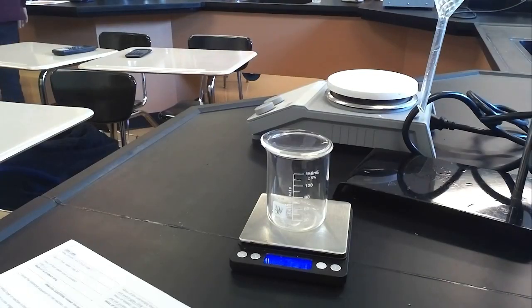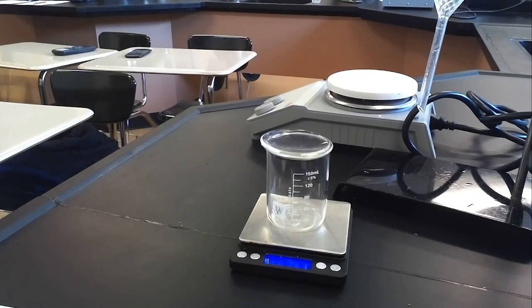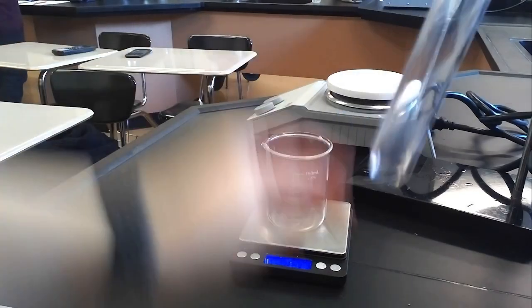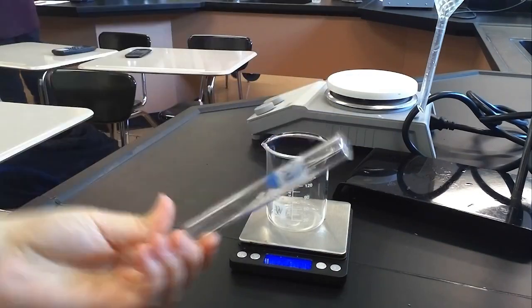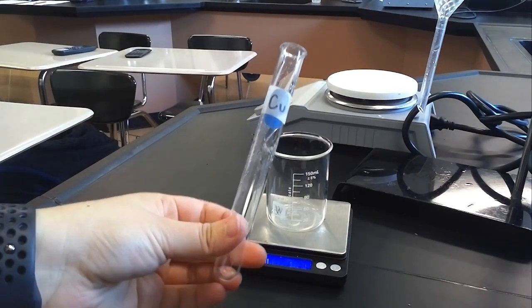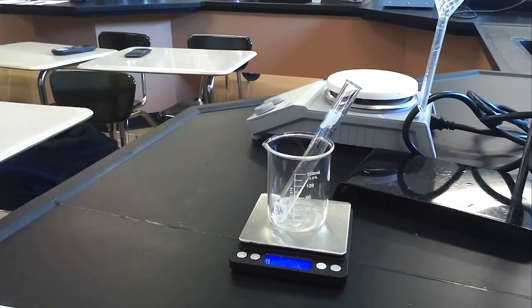Step two says to set the watch glass aside and put your empty test tube into the beaker on the scale. I have my clean test tube — it has some water in it from rinsing, but since I'm going to zero out the scale right now I'm not too concerned about getting it completely dry. I place both pieces of glassware on the scale, hit tare, and then measure about 0.3 grams of copper chloride dihydrate.